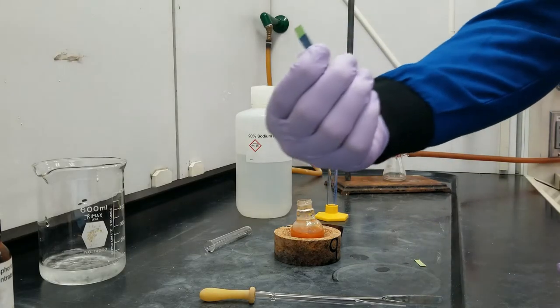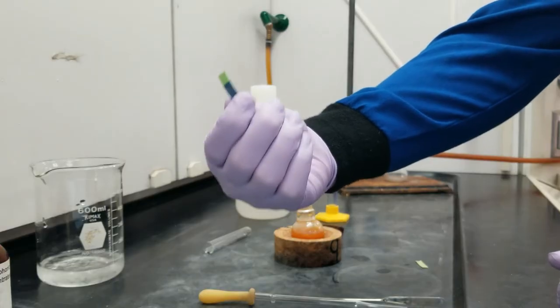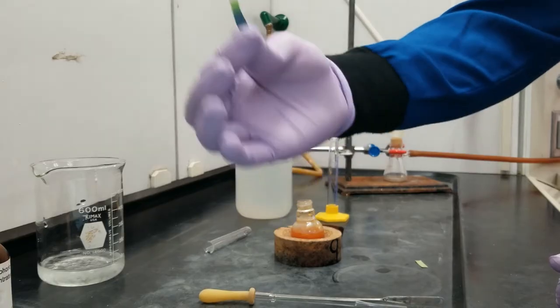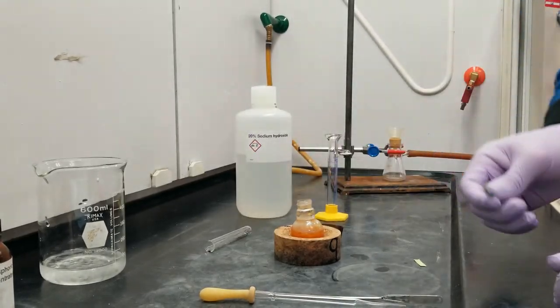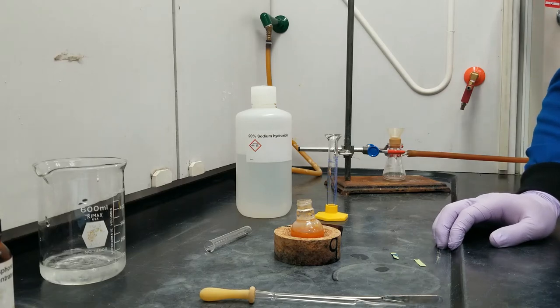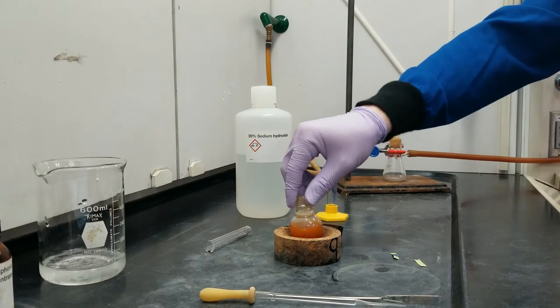With both styles of pH paper, blue is for basic, whereas red would be for acidic. And so I'd say that we have quite exceeded the buffering capacity of the system, and we are now quite basic.